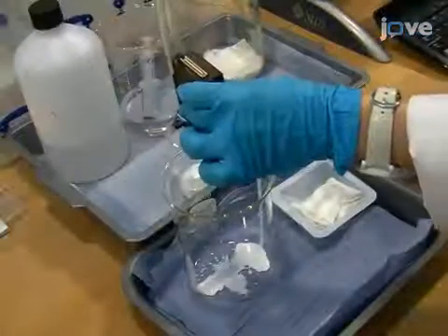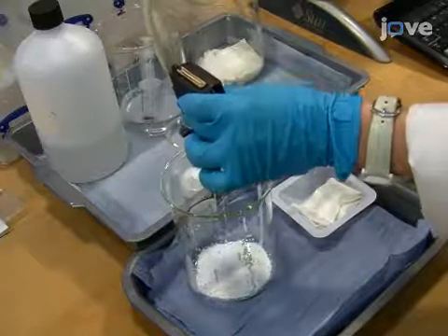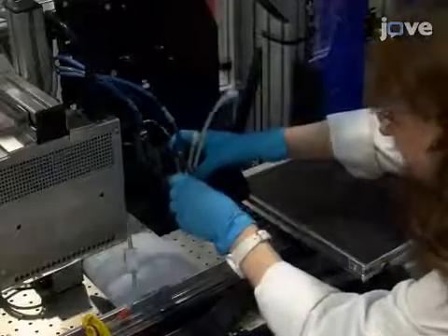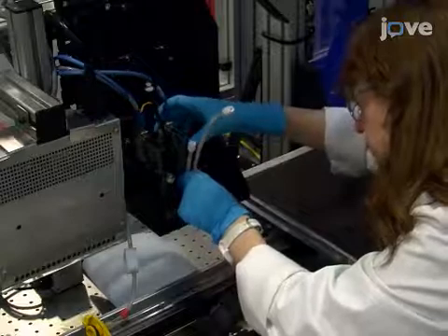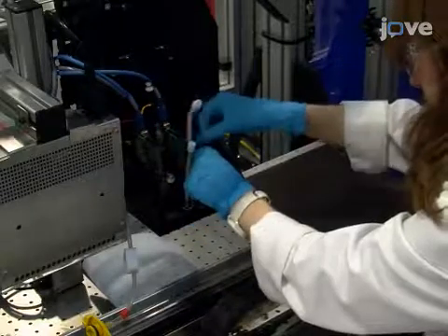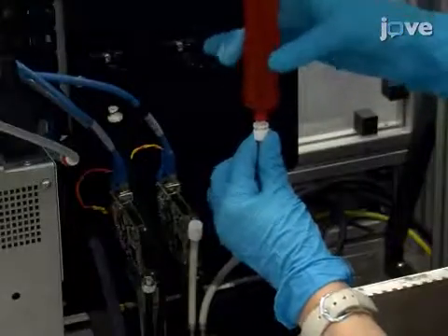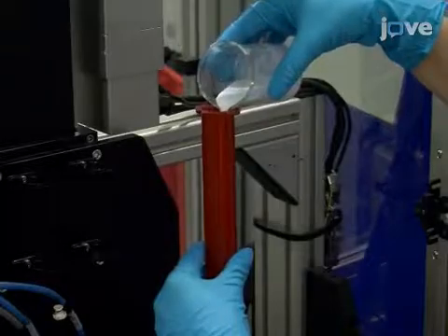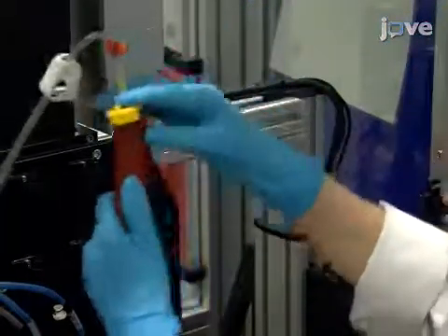Flush the print head with ink through the port located on its side to displace any air or cleaning solution left within the reservoir or nozzles. Insert the print head into the printer and connect it to the head personality board. Continue by loading the ink into the 150 milliliter syringe located above the print head and seal it by attaching an airtight cap to the top of the syringe.